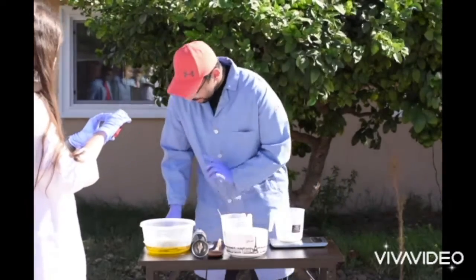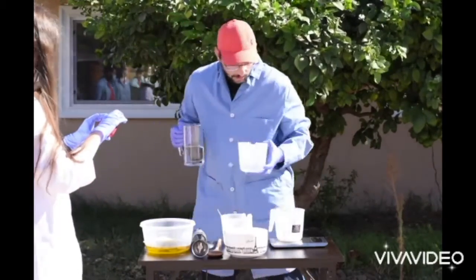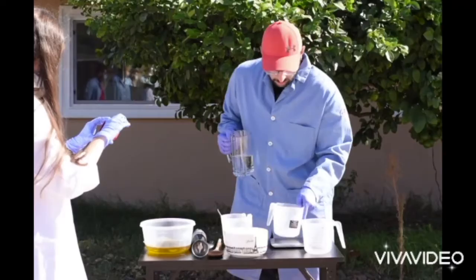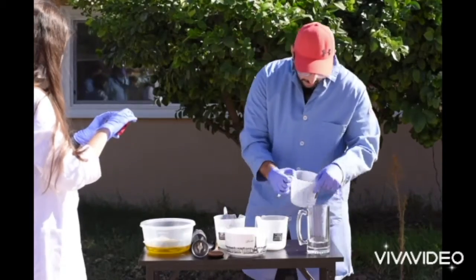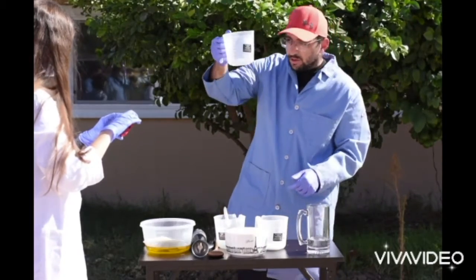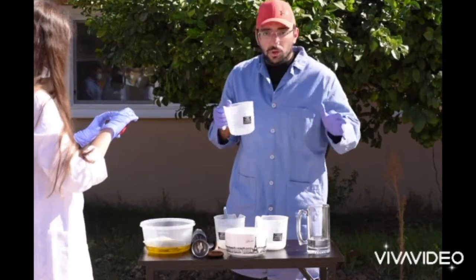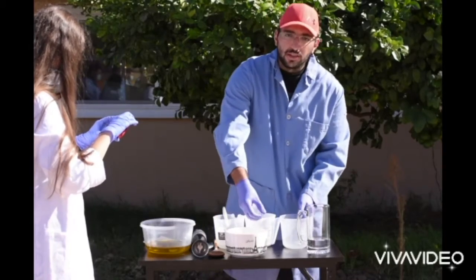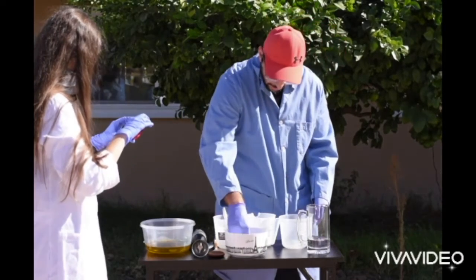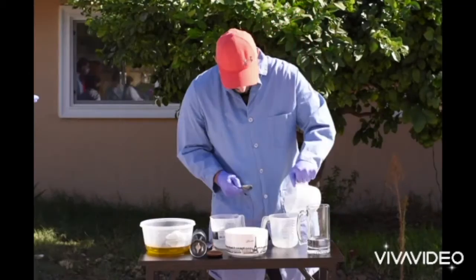We're gonna add only 200 milliliters of distilled water. Okay, here we go. We have a little less than 200 milliliters, right? It says 200, but I'm gonna take 100 milliliters of water and 100 of ice, because when you add water to sodium hydroxide, it tends to get very, very hot. So it's better to cool your reaction down by using ice, and it turns into water, so that's good.